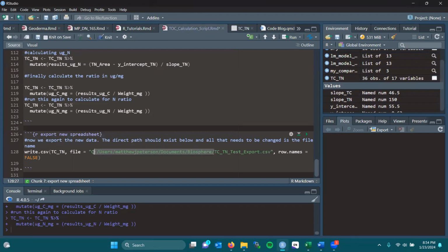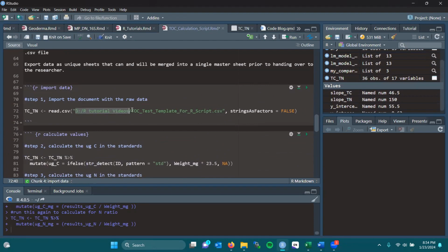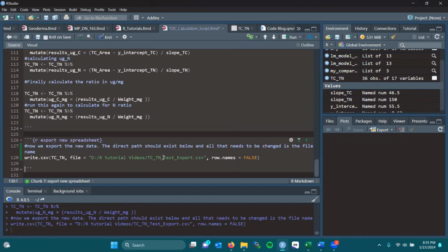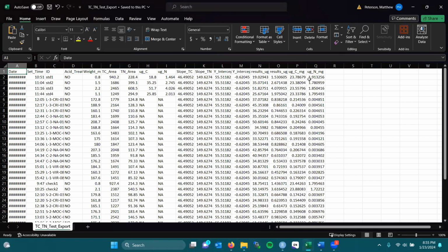Now, that is quite a simple function. So instead of clacking away on your keyboard to input all of your data in R or in Excel, and then do functions within Excel, you can put a little effort into R, streamline your processing, and spit out your data and save yourself a lot of time down the road. So we've exported this, and as you can see here, we have all of the data that was just in R reflected here in Excel. So if you have people that you need to deliver the data to, here it is. You can send it off.